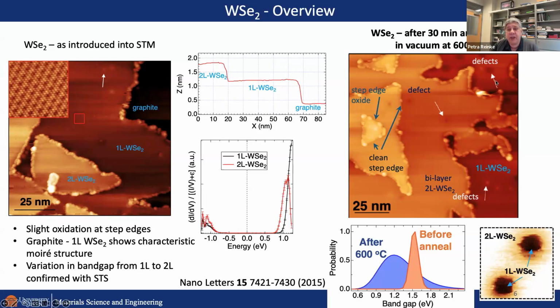And you have some defects which are really large, and I show a sample here in the right-hand corner, and these are essentially holes in the material. Which is quite intriguing, and they still generally tend to retain a somewhat spherical shape, which we also found quite surprising in this context.